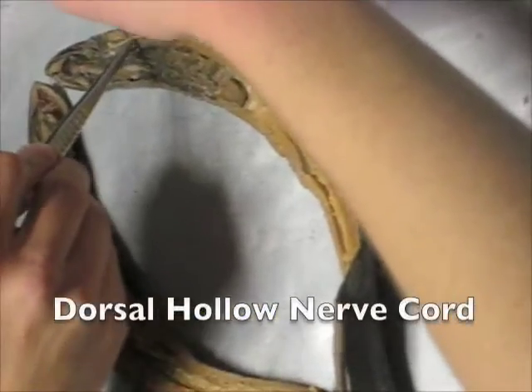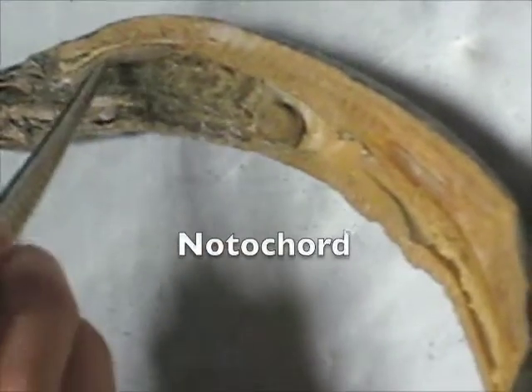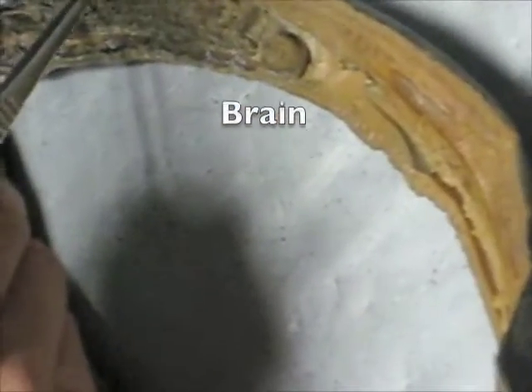The nerve cord? This is the dorsal hollow nerve cord. It goes right through here, all the way. That's the notochord, and then you've got the brain right here. Okay.